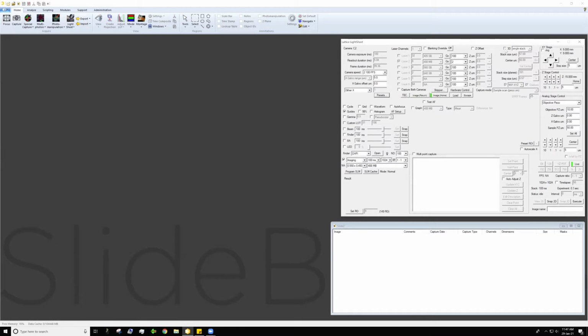Step 10. This is where you will move the stage to find cells of interest. Tick jog only when you've found your cells and are searching for rare events. Z stage controls which plane on the sample is in the focal plane of the sheet. Step 11. Wait for Piezo, wait for PZ, should be ticked if running very fast imaging with no wait time. It stops doubling and shaking artifacts at the edges as the piezo returns for the next stack.